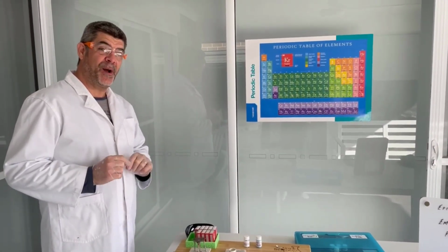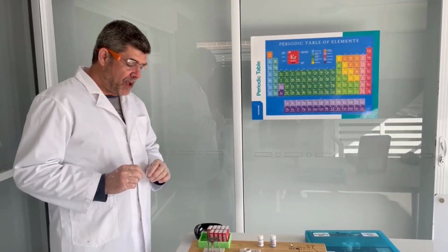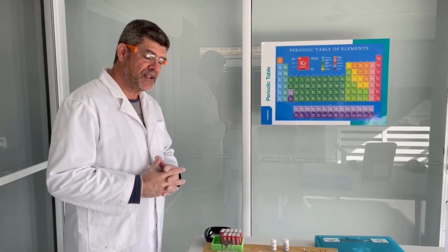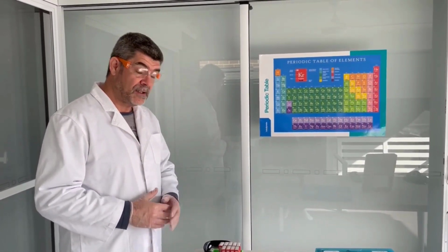And that is why we use a clay pipe triangle whenever we're heating ceramics. So this time I'm going to have to repeat the experiment, and of course one of the important things that we sometimes don't emphasize enough in science is the fact that we sometimes do need to repeat our experiments. Time is always a big issue when you're working through your experiments in the laboratories at school. So we want to make sure that where we have the time to repeat something, we do. So I'm going to repeat it.